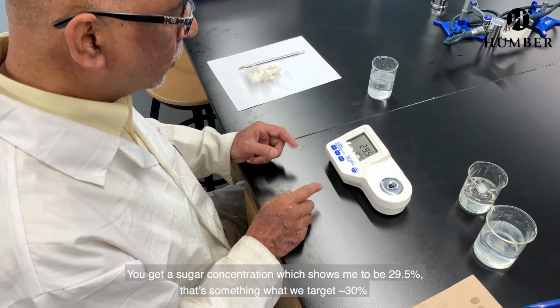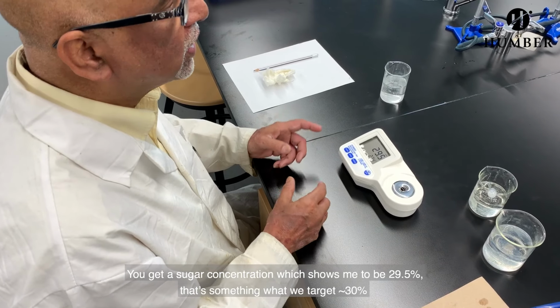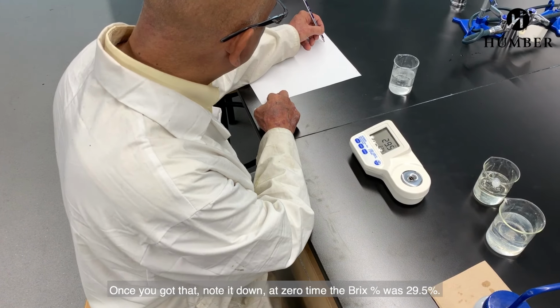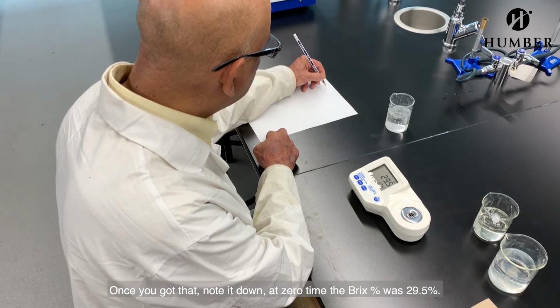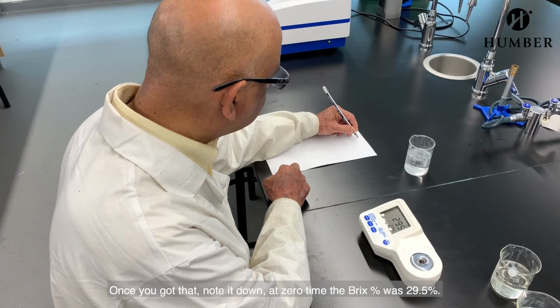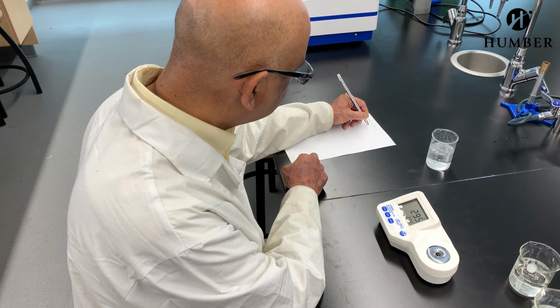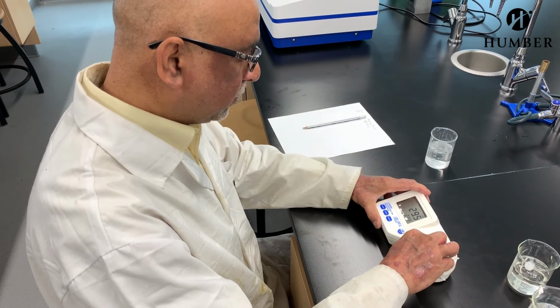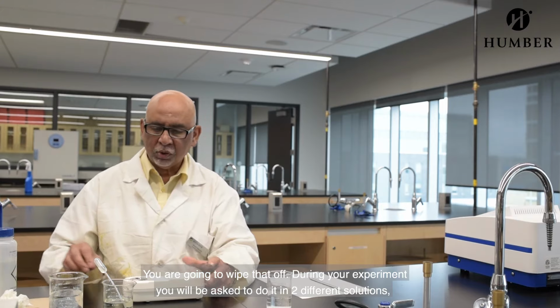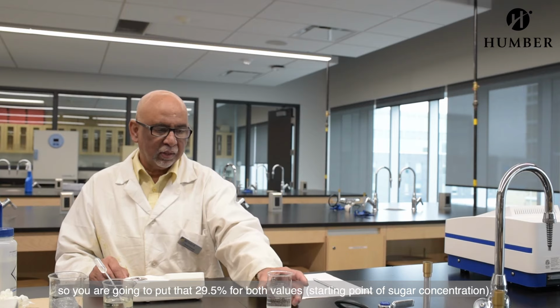When you press read, you're going to get a sugar concentration which shows me to be 29.5%. That's something we generally target, around 30%. Once you have got that, you're going to note that down. That means at 0 time, the reading of Brix percentage was 29.5, sorry. So you're going to wipe that off. During your experiment, you would be asked to do it in 2 different setups, so you're going to put the 29.5 for both the values.